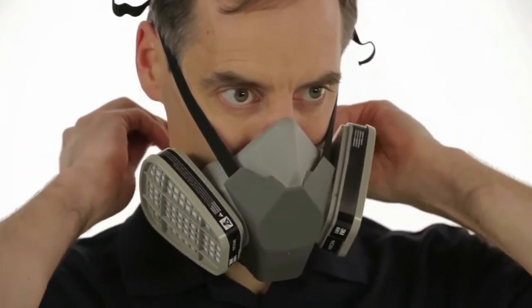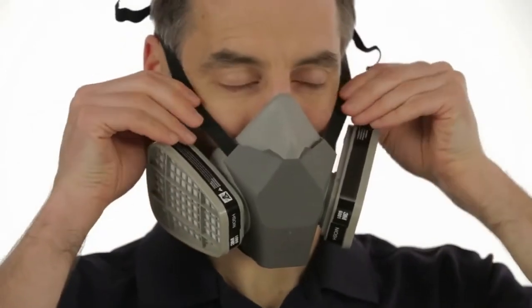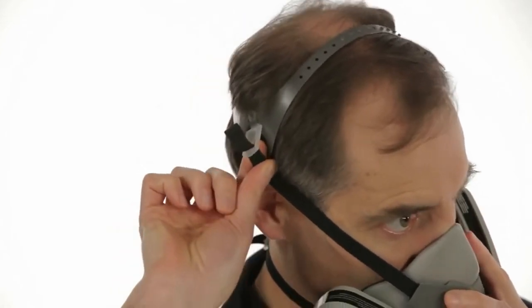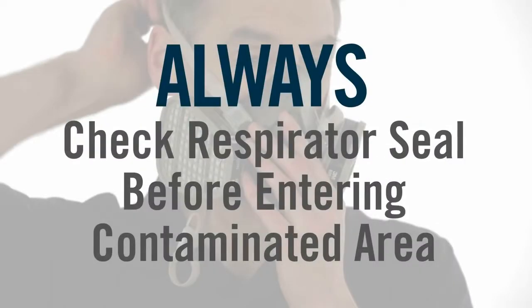Tighten the straps by pulling on the ends, top straps first, then the bottom, until the respirator fits securely but comfortably. Balance strap tension by adjusting at top and bottom strap buckles. If the straps are too tight, push out on the back of the buckles to loosen them. User seal check. Always check the seal of the respirator to your face before entering a contaminated area.